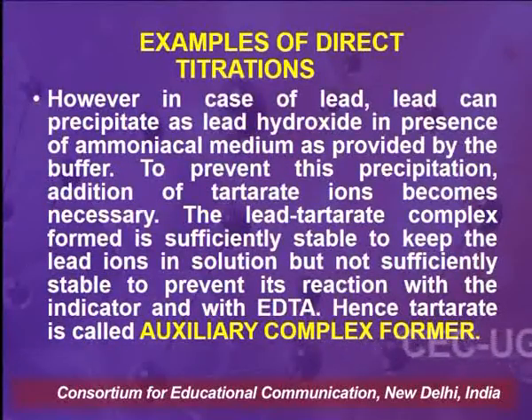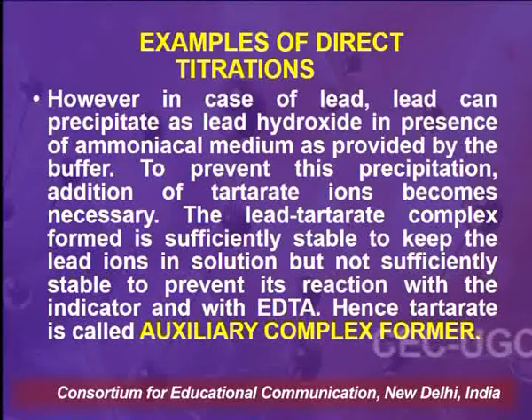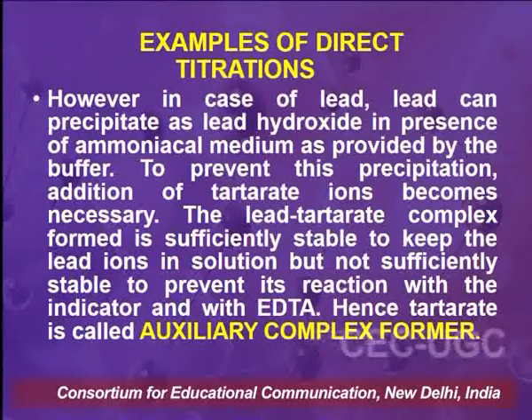However, ions like lead can precipitate as lead hydroxide in the presence of ammoniacal medium as provided by the buffer. To prevent this precipitation, the addition of tartrate ions becomes necessary. The lead tartrate complex formed is sufficiently stable to keep the lead ions in solution, but not stable enough to prevent its reaction with the indicator and with EDTA. Hence, tartrate is called the auxiliary complex former.